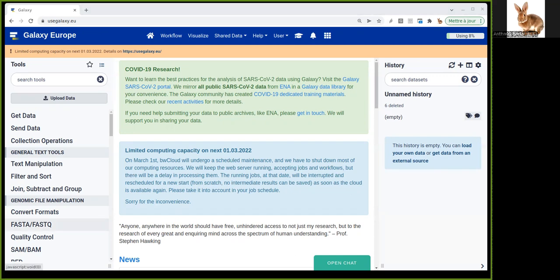In this tutorial, we're going to perform repeat masking on a fungal species, Mucor mucedo. This genome was assembled following the Flye assembly tutorial in the assembly section.